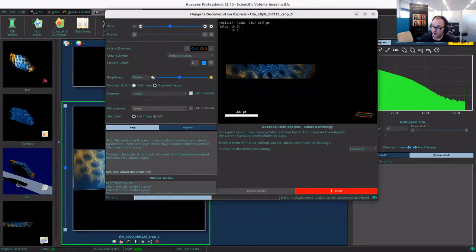So we can see its progress here on the bottom. I think it's currently doing channel number 2, right? Because we have 2 channels. So the first channel is already ready. The first number indicates the overall progress, and the second number indicates the progress on the sub-task. So it's a useful tool to get an idea about how long a certain operation will take.